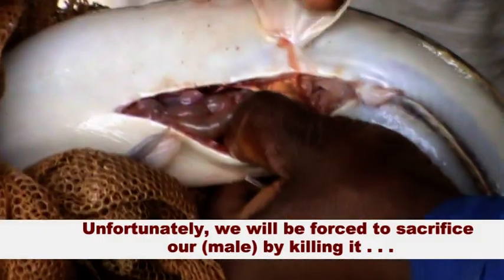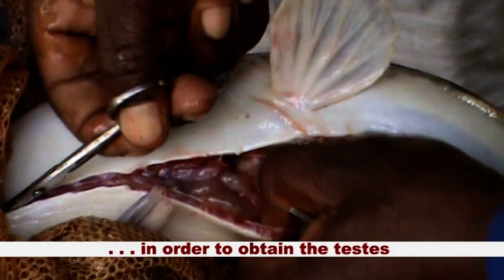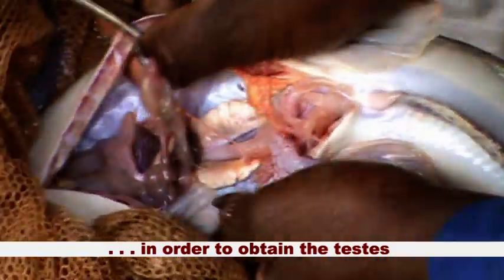Unfortunately, we will be forced to sacrifice our fish by killing it in order to obtain the testes.